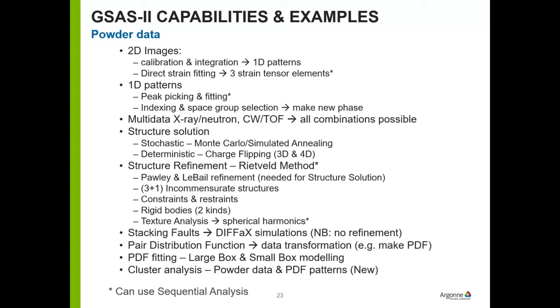The other thing is that these guys down here are the really special sorts of stuff. One is you can compute what the effect of a stacking fault is. Unlike BGMN, I think is what it was, there's no refinement possible. One day I'm going to go look at BGMN and find out how the heck he did it.